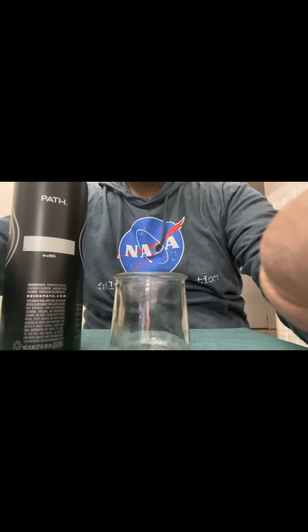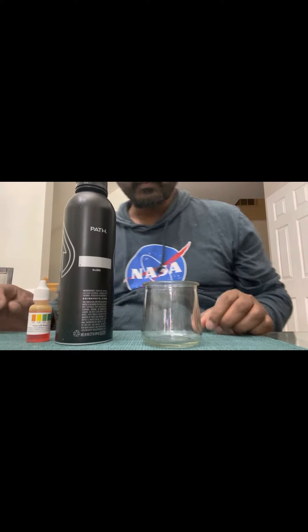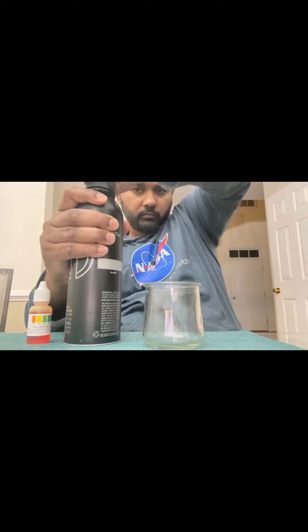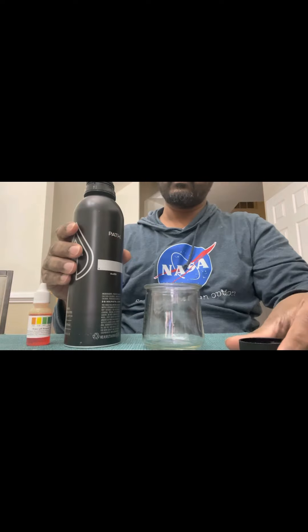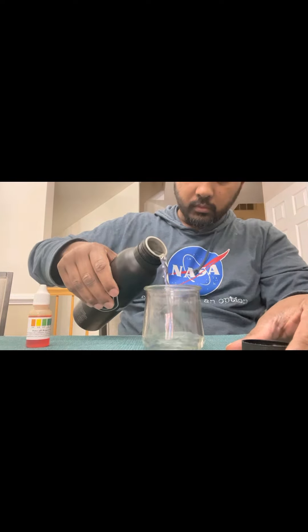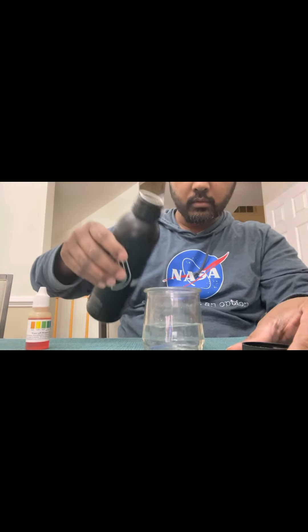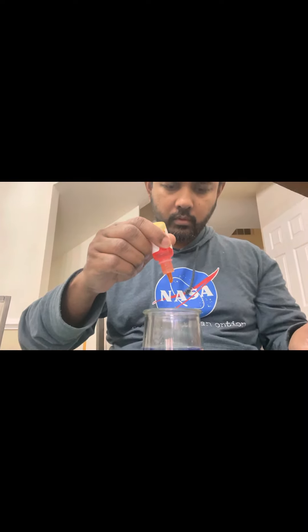This is the bottle. I'm going to add the pH testing drops into the water to get a reading. Adding the drops in now — it's showing a color result.